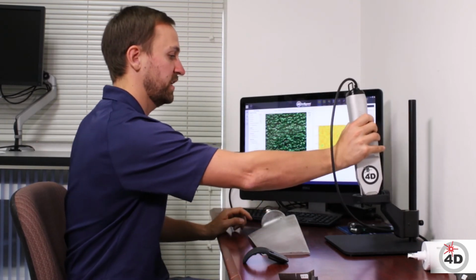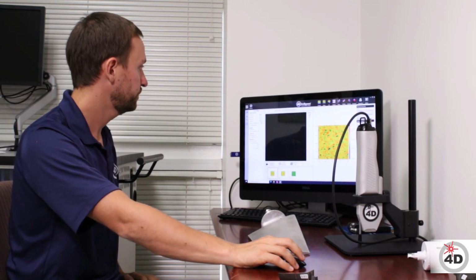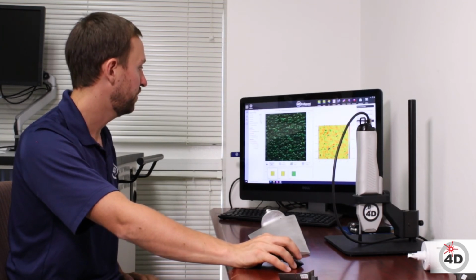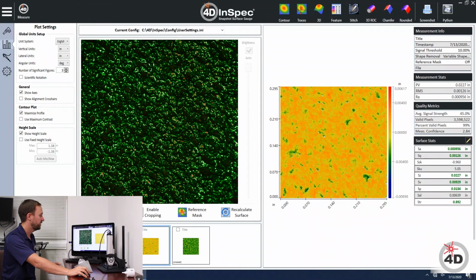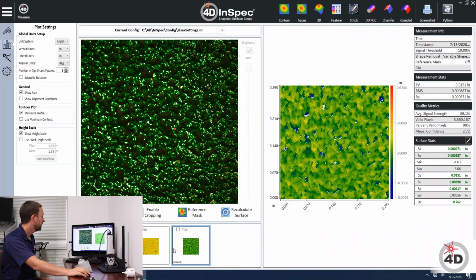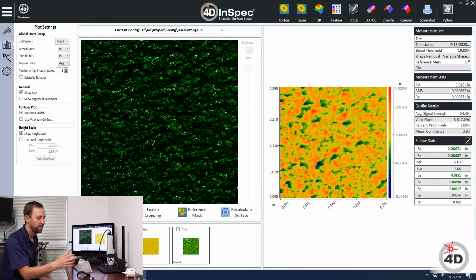Okay, bear with me for a second. Now, going between these data sets, you might know from when you start analyzing the data using whatever analysis you need to do, either contour screen, traces, or what have you, you'll be very clear what has deeper pits and what doesn't. Now, from the casual viewer, let's say you're presenting this data to your boss or a customer, whoever is buying your parts, it's very hard visually to tell which one has the deeper pits, which one has higher areas on it.